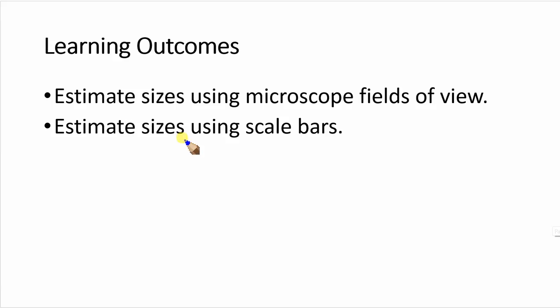So just to recap, we've been estimating sizes, we've been using a microscope's field of view to estimate the size of our specimen, and we've also been using scale bars to estimate the size of our specimen.